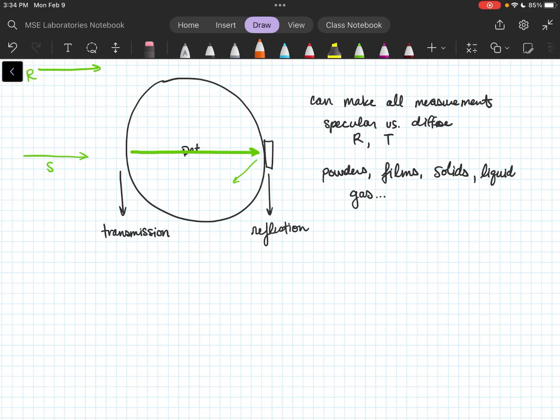Something you can do with the results that I wanted to say really quickly is you can measure the quantity of something using something called the Beer-Lambert law. Again, there's plenty on the internet about that, but the Beer-Lambert law is a big important thing for UV-Vis.